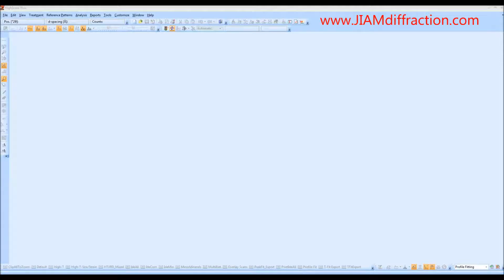Hello, my name is Michael Kaler and I am the lab manager for the JIAM Diffraction facility located at the University of Tennessee Knoxville. This video will cover how to use HighScore Plus to determine crystallite size and microstrain using Rietveld Refinement.